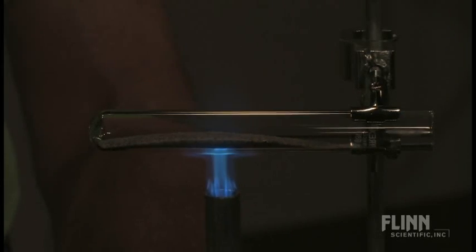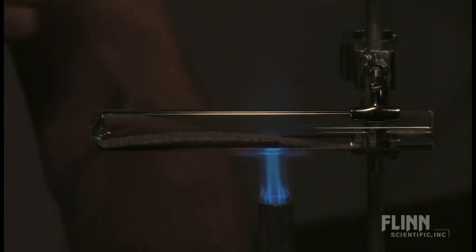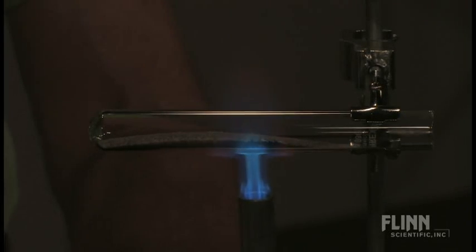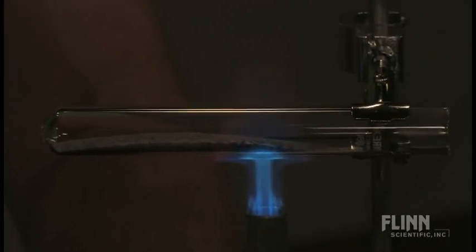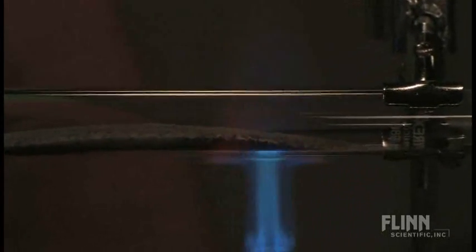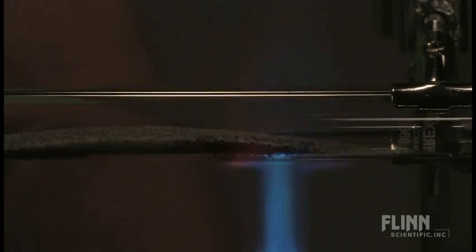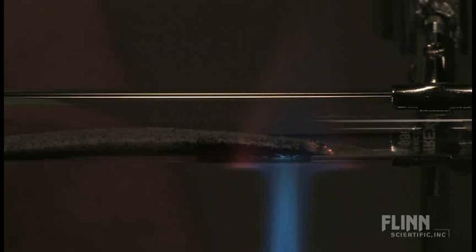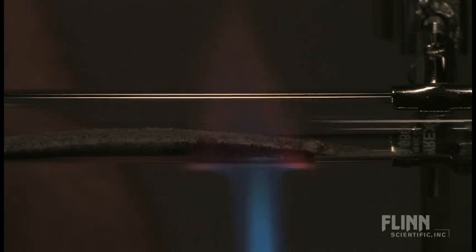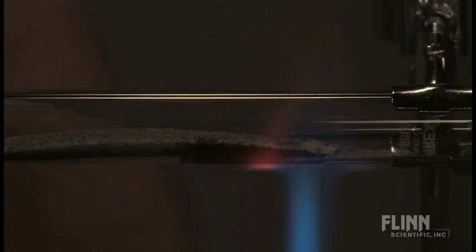There it is. How cool. And you can see some of the little sparking right now on the edge of the test tube. That little bit of sparking is the magnesium reacting mostly with the oxygen that's trapped inside the test tube. We also used up some of that oxygen that was in there when the hydrogen. All right, see again, you can see right at the surface of the sand right now, just a little bit of glowing.